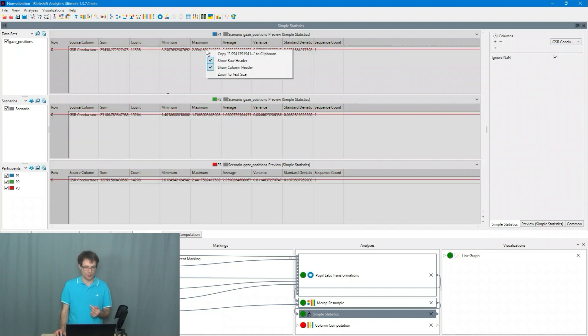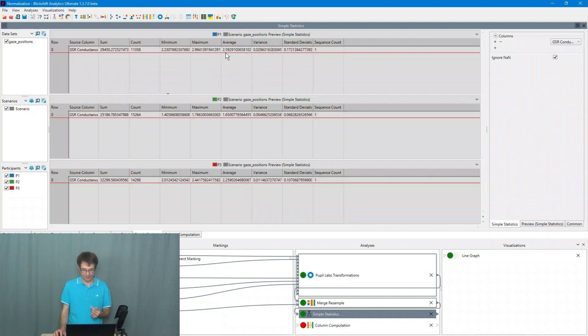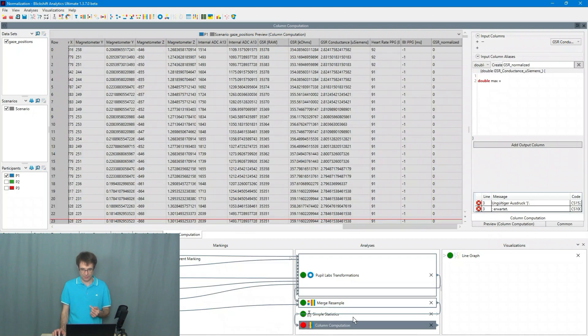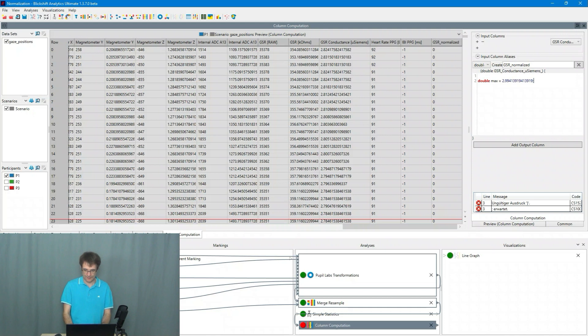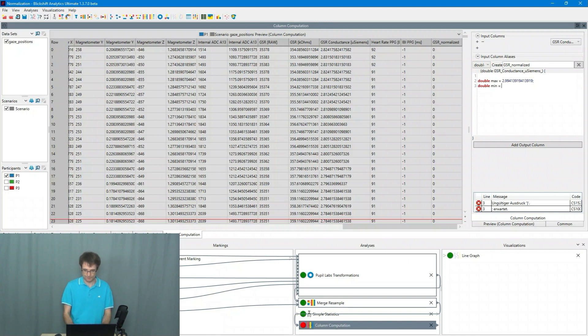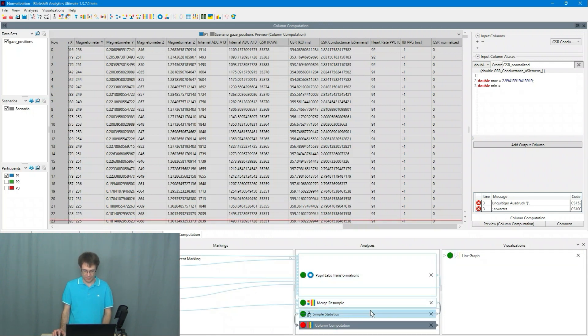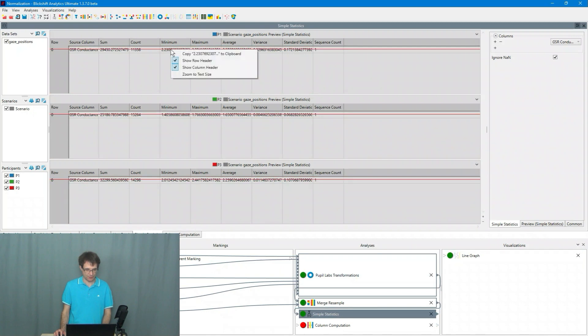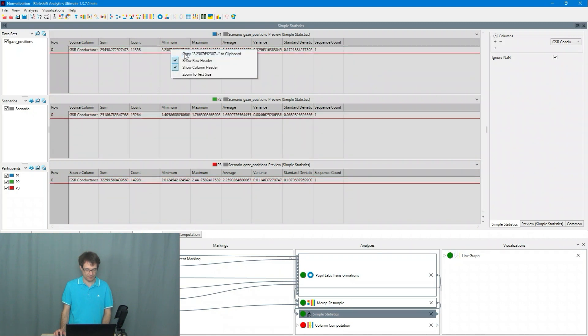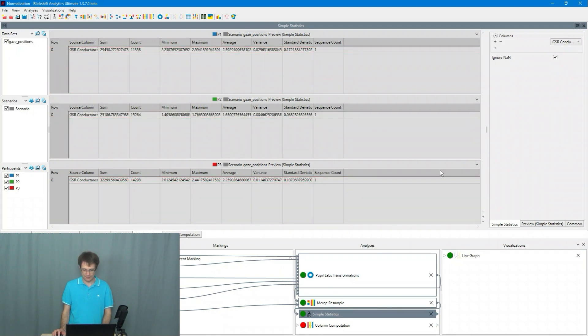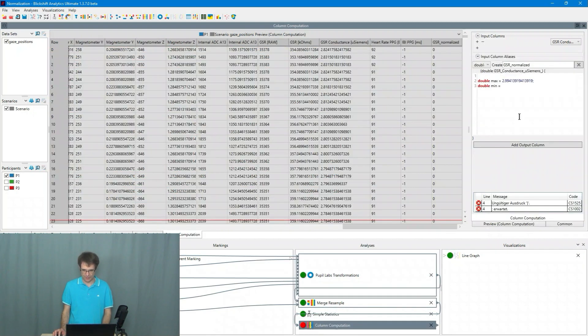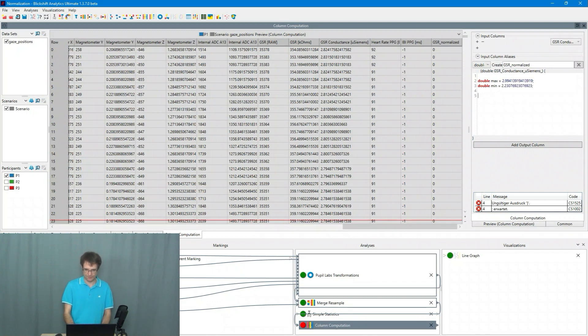So I copy it to the clipboard. I go to the column computation and I insert it here. I do the same for the minimum. So I go to the simple statistics. I click on the minimum. I go to the column computation and I insert it.